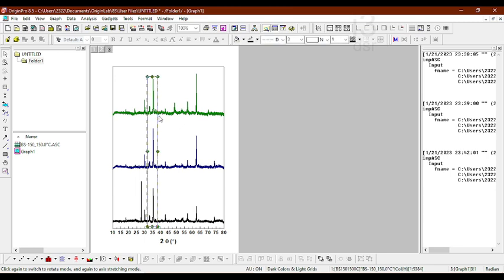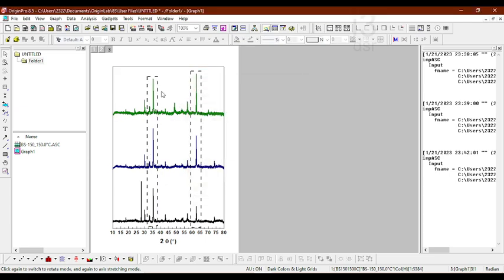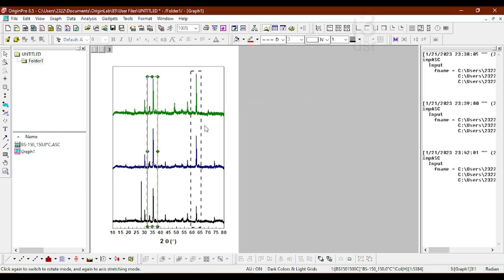I'm going to press Ctrl C, Ctrl P, this data is copied here, like this. So now I have highlighted that this and this are changed. I think the color contrast is not enough. I'm going to double click on this, or you need not double click, click here, select, let's put it on red. Yes, I could see a difference.